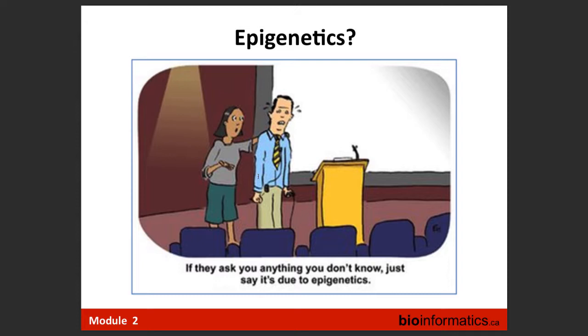Wait a sec. I didn't say that you can't compare ChIP-seq data. We are doing this. That's the goal of consortiums and of many, many publications. What you cannot do is compare, for example, IP directly to input. You cannot say, let me look at the promoter of the gene SP1, count the number of reads in my IP, then count the number of reads in the input, compare, and say whether this is enrichment or not. This I cannot do. But once you analyze all the data, I can.